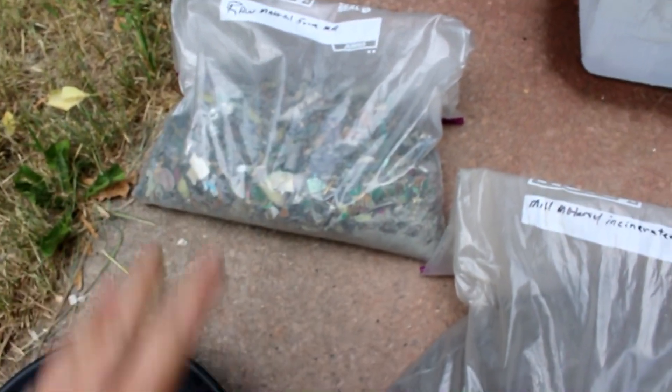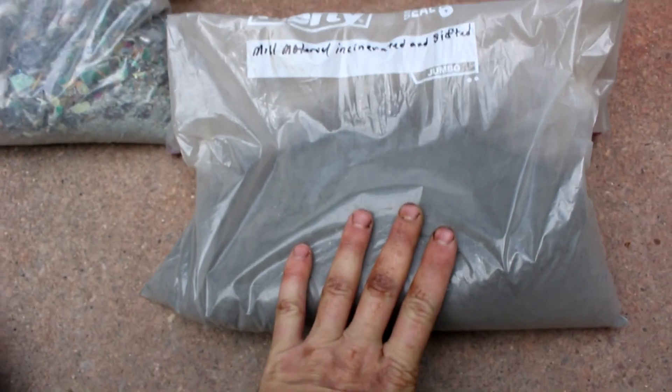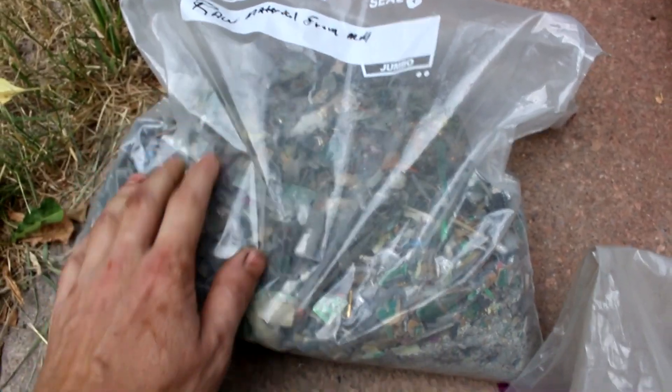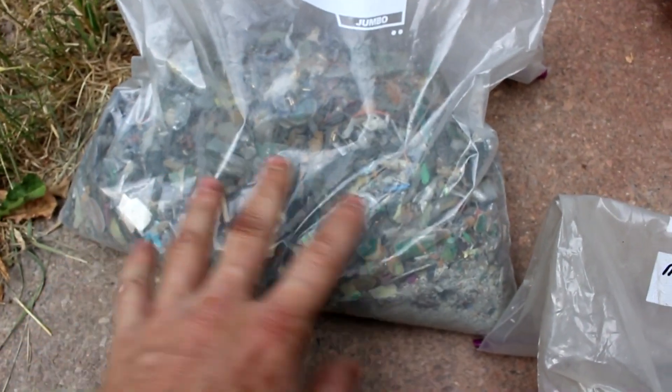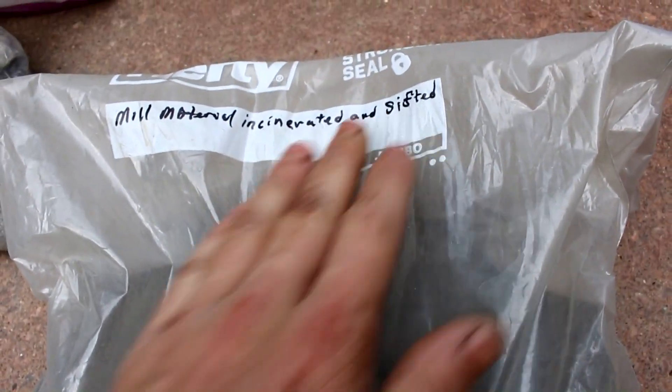Hi everyone, welcome back to Cody's lab. I figure it's about time I finally get around to processing this material that came from electronic computer parts. This is what the material looks like after it had been chopped up in a ball mill — just computer motherboards and stuff. And this is what it looks like after it's been incinerated and sifted.